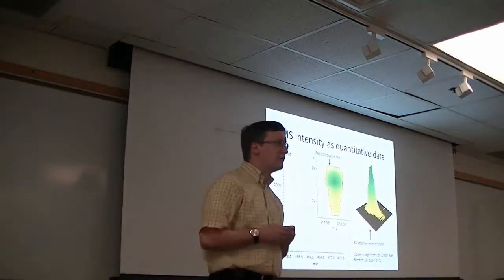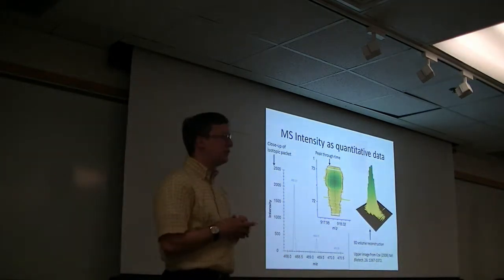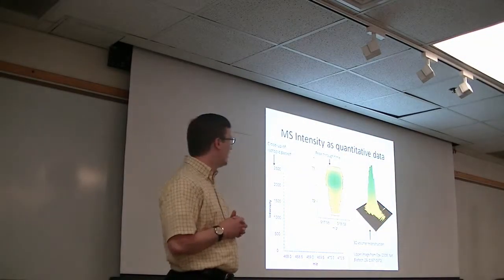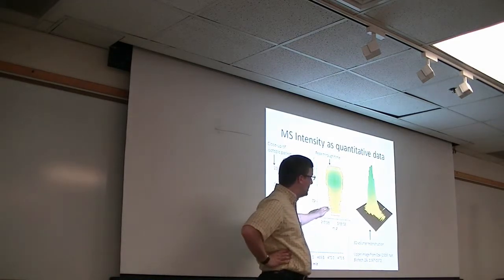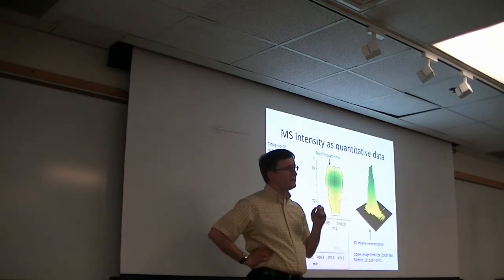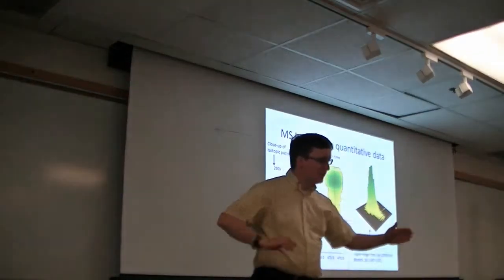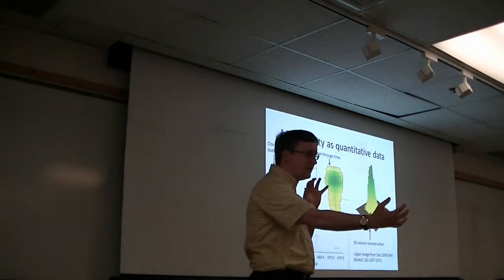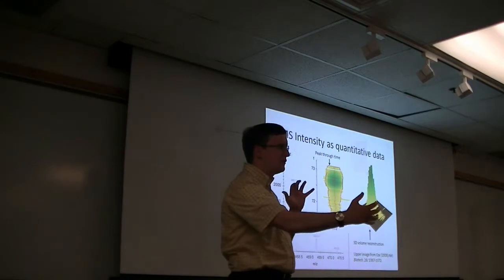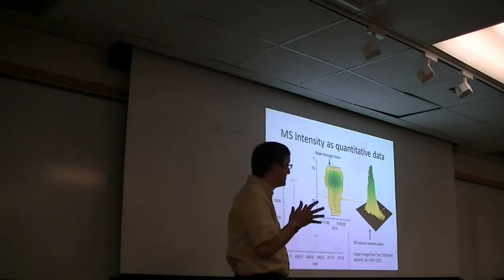These are figures that were produced in the original MaxQuant paper, and I think that they are useful for us to think about. When we look at a given peak, that peak has a 3-dimensional representation. We have the M over Z values that any of the intensity fall within. We have the retention time through which we're seeing those, and we have intensity patterns that we hope will be nice and distinct, right?